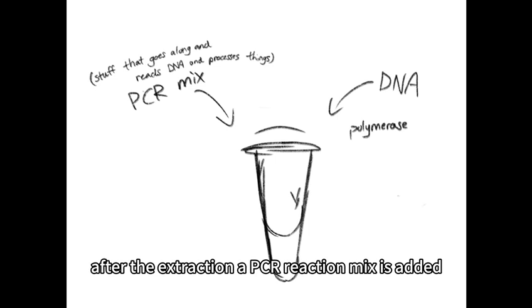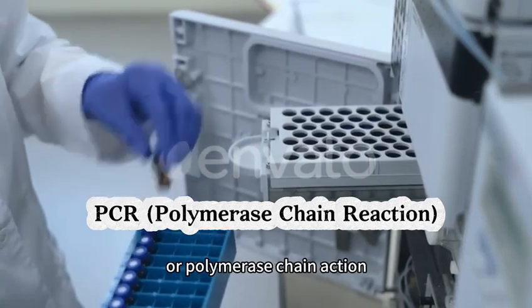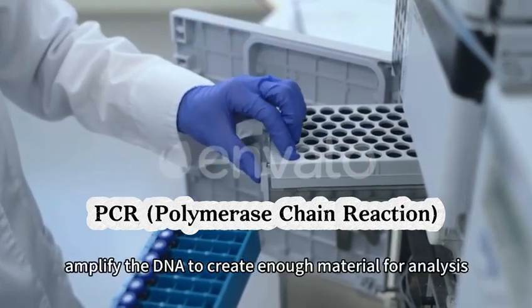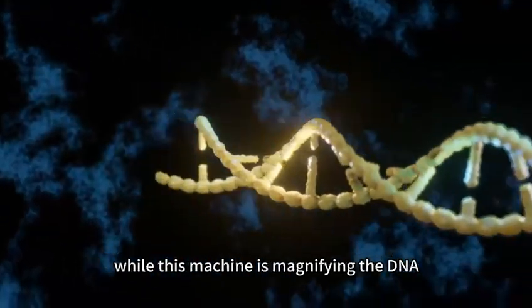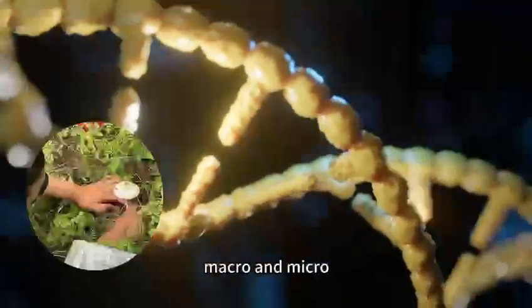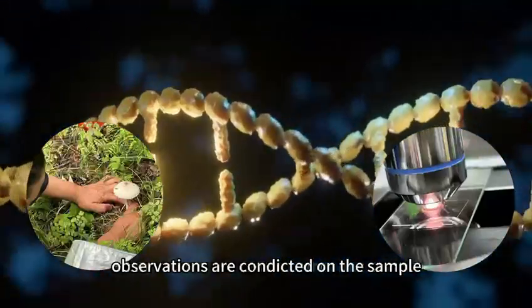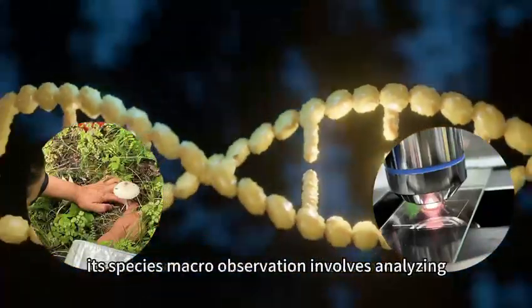After the extraction, a PCR reaction mix is added. Then commonly used techniques like PCR, or polymerase chain reaction, amplify the DNA to create enough material for analysis. While this machine is magnifying the DNA like a photocopy machine, macro and micro observations are conducted on the sample to serve as further evidence that helps discover its species.